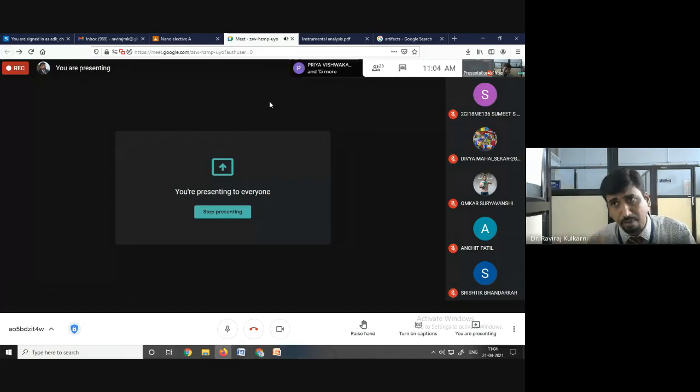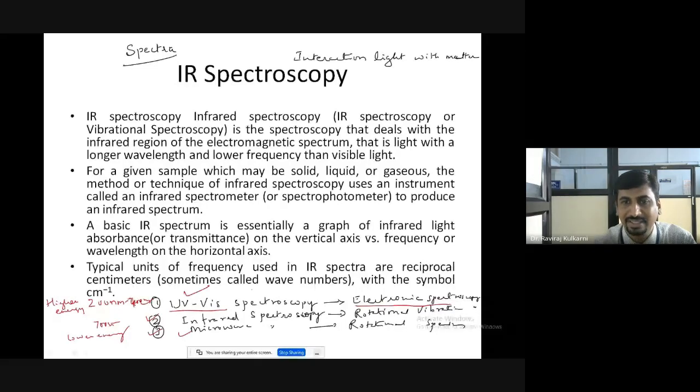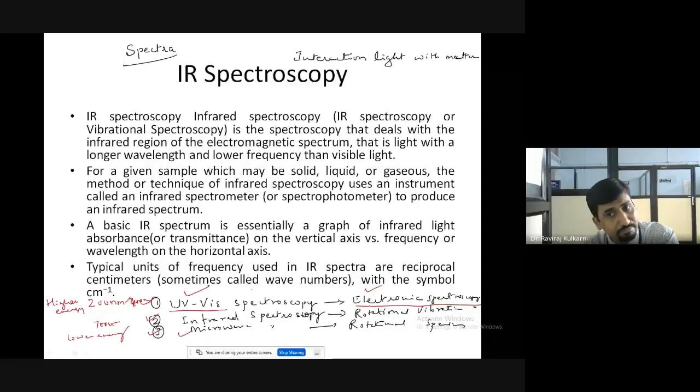Now comes a very powerful pehlwan and punches it. The bag not only vibrates and moves, the sand inside will come out. He has more energy. Similarly, UV visible is like the hefty pehlwan. If he punches it, electrons come out. That's why it's called electronic spectroscopy. UV visible light is powerful light, it can excite electrons, like the sand coming out of the bag.